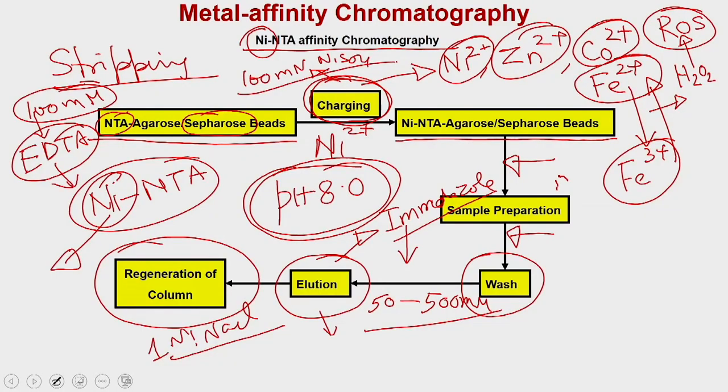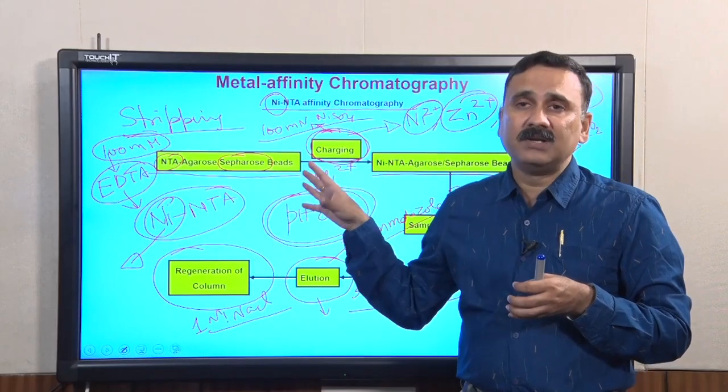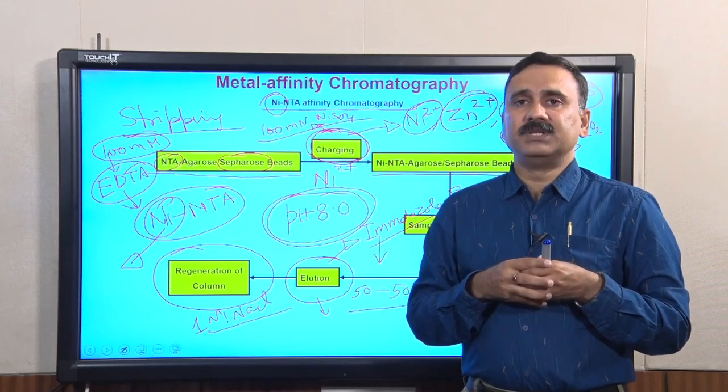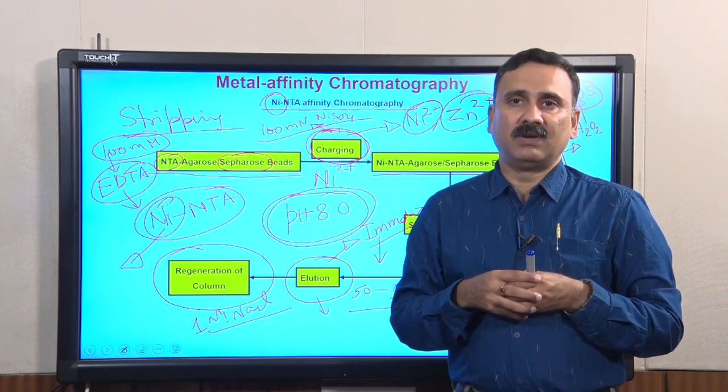Now, how to perform this affinity chromatography in your laboratory? For this I would like to take you to my laboratory, where we are going to show you each and every step: how to do the charging, how to equilibrate the columns, and then how to purify the protein using the nickel NTA affinity chromatography.